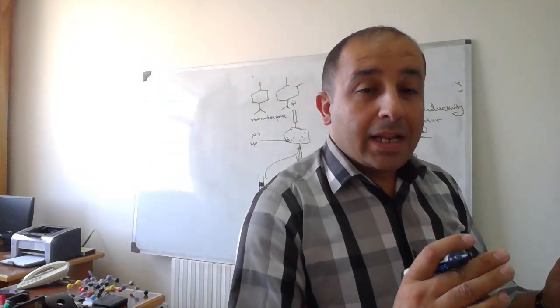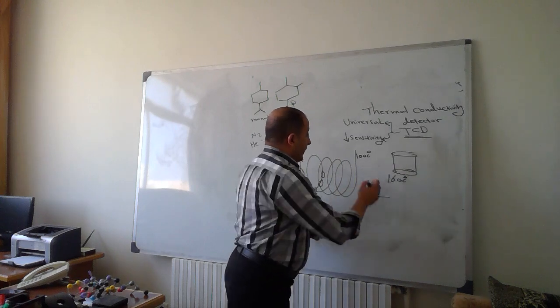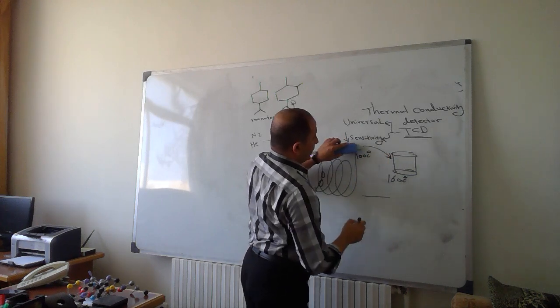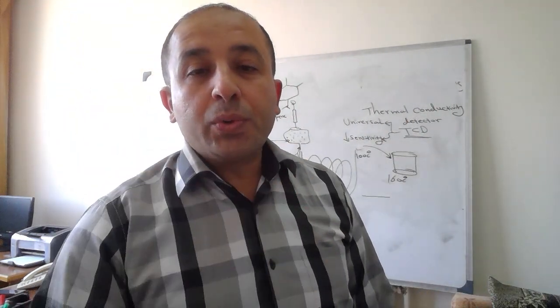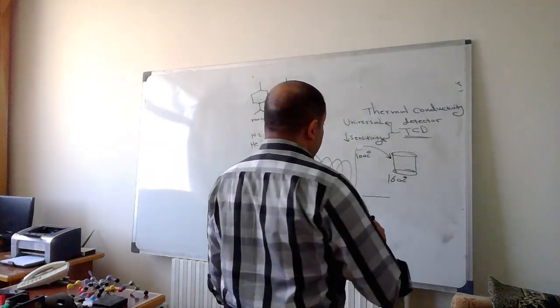Now, once the cloud of analyte comes together to the detector from the column, this blow of the compounds will reduce the temperature of the detector.